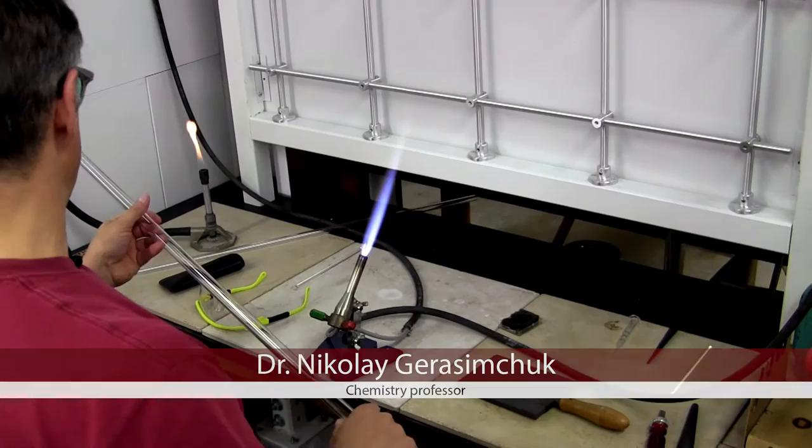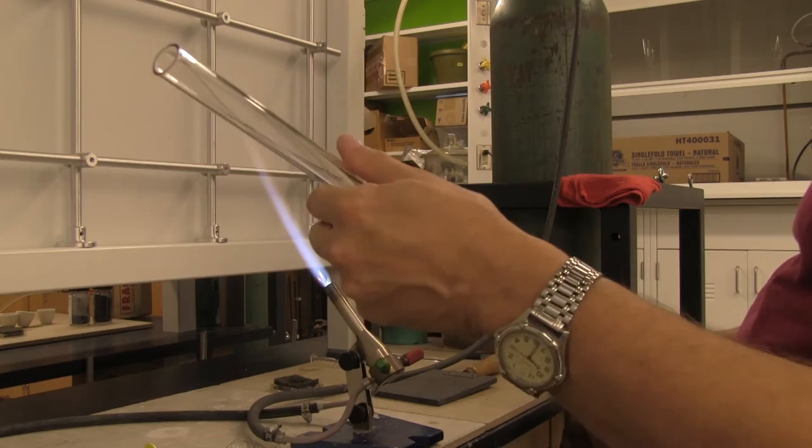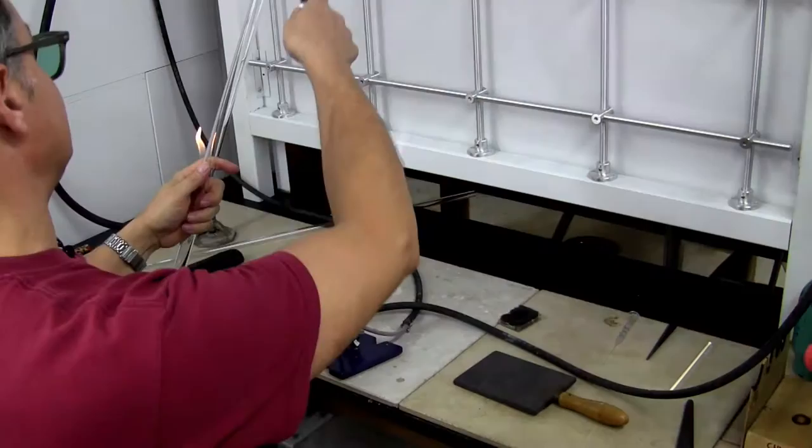In order to make ampoules, you have to start with a glass blank, which is just a pipe. Glass was made by fire and can be treated and cut by fire. That is how it's done.